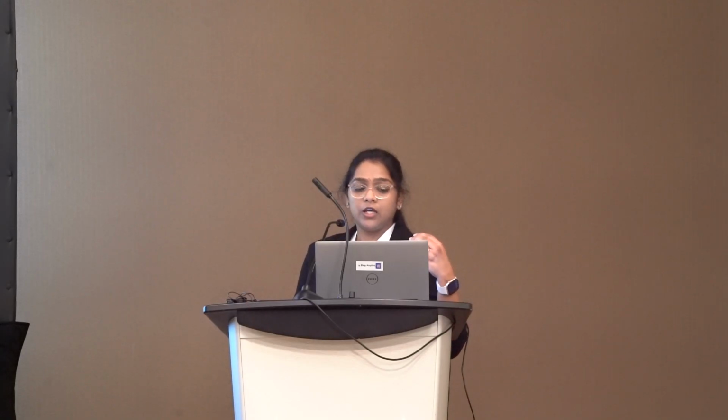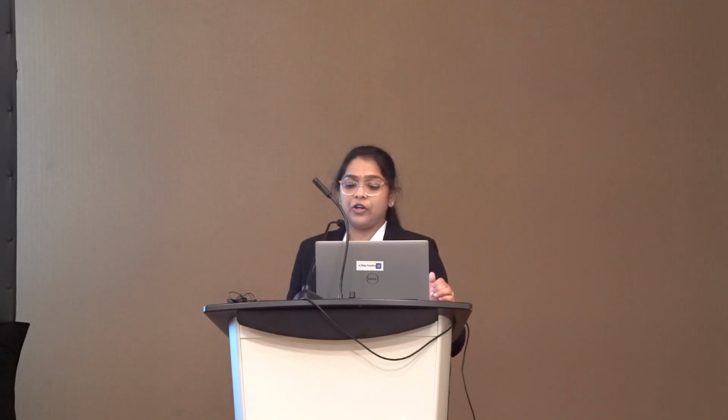Here after this is at day 1. So here, immediately within 24 hours, the plant transcriptional machinery is entirely shifted to chemical defense. And this is the alpha-linolenic acid metabolism, which is the most significant pathway.